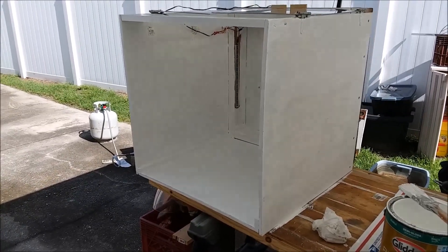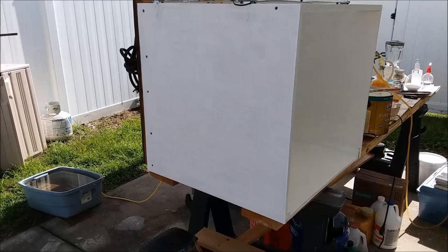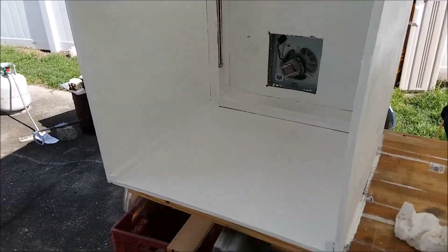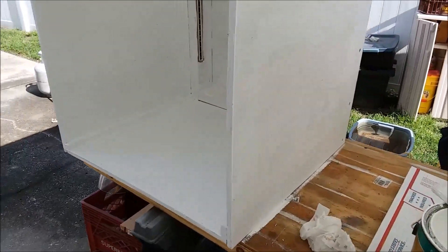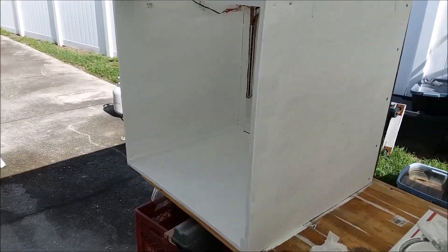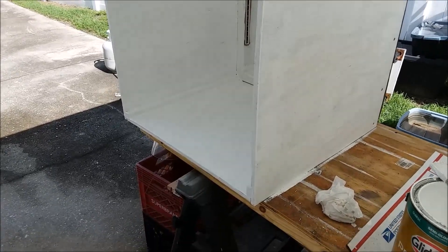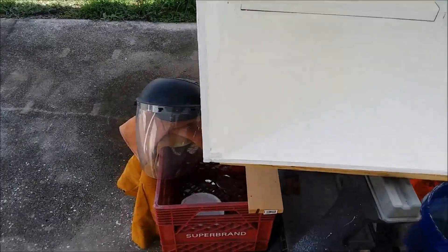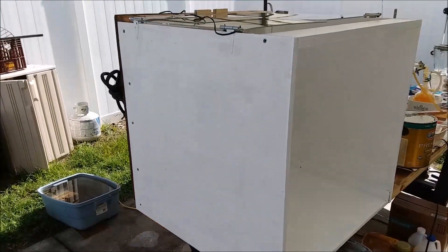I decided to go ahead and throw a coat of paint on the outside of the box too, at least the parts I can get to while it's in this position. It's starting to look like a piece of professional laboratory equipment. I decided to paint the outside since who knows when I'll find the ambition to get the painting stuff out again. I'll probably get another coat on it before I'm done — this thing is getting close to being operational.